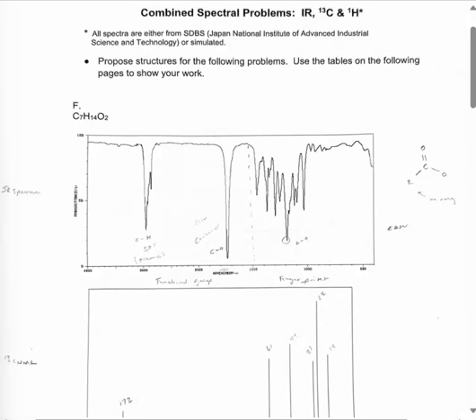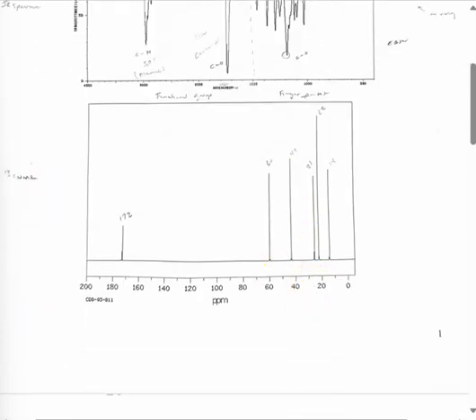So next we'll look at this 13 carbon NMR spectral analysis, which recognizes distinct carbon environments in compounds. It's also worthy of noting that 2 or more carbons that have the same environment can be represented by a single line, which we will see here eventually at the 22 marker.